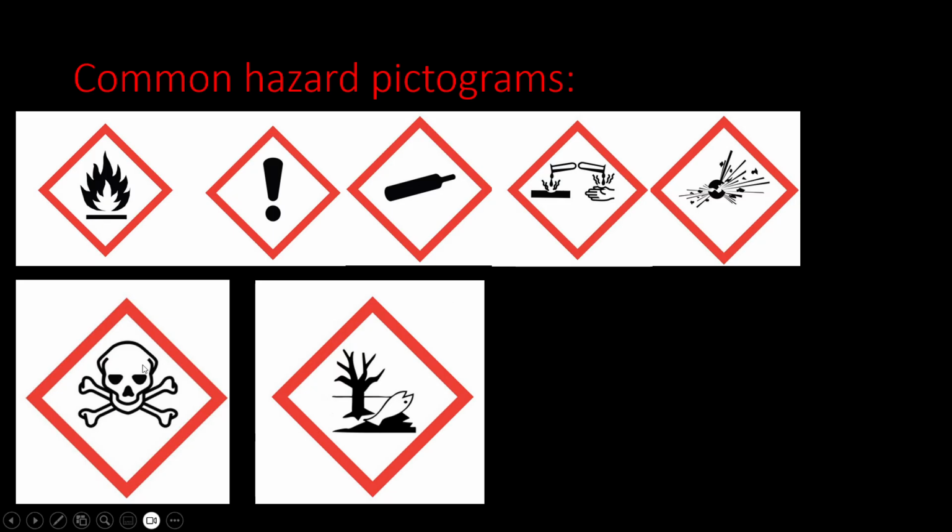So all these things it is going to tell in this skull hazardous symbol. Whereas this one is the indication that the particular chemical is hazardous to the environment, means you should not put it into the commode or put it into water or anything like that. So that is the environmental safety precaution.